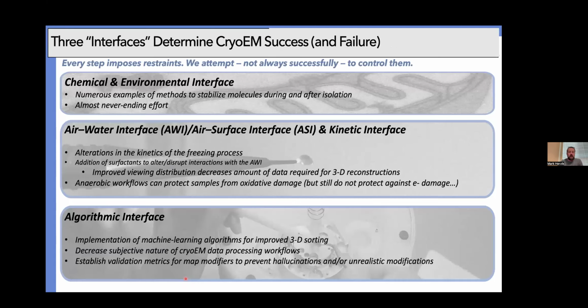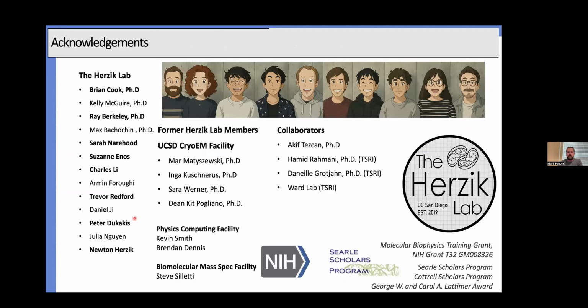And so across that, as we think about how we deal with these different interfaces, you may have to apply all, but we're hoping that between Surfact and some of the algorithmic stuff, you can improve your sample.